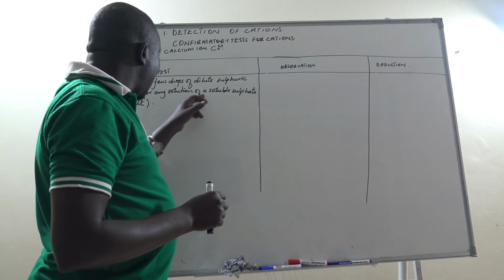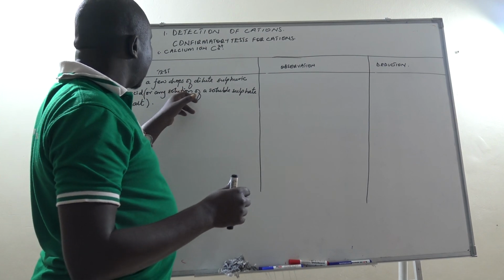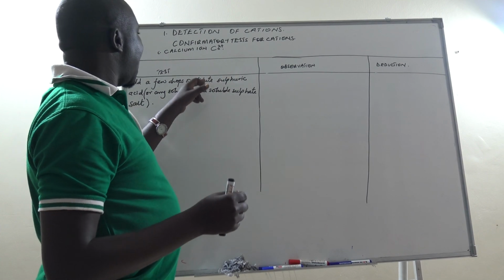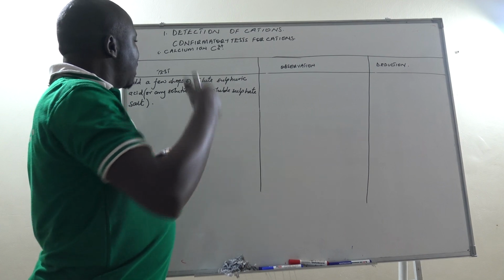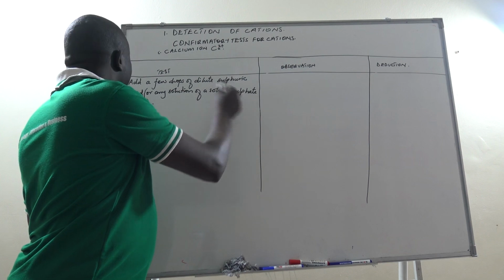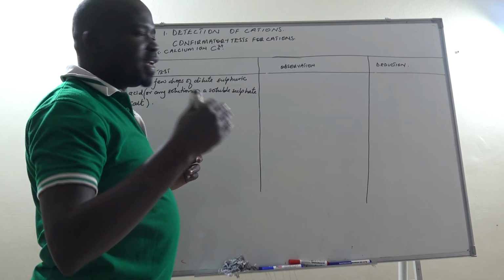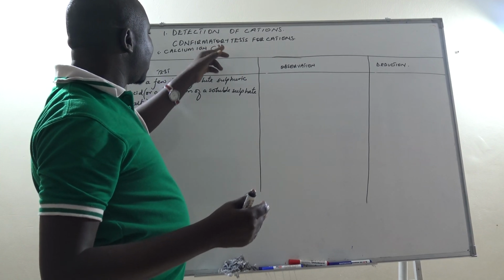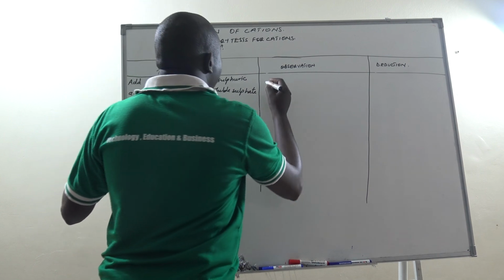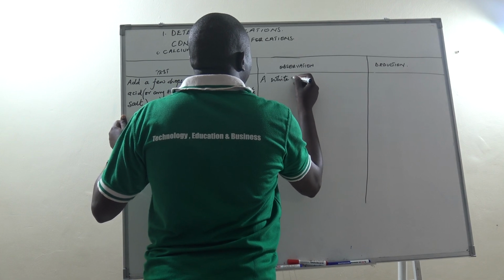If it is readily available and it is having a low price, or it is cheap, then we can use it in this case for testing for calcium ion, instead of using dilute sulfuric acid, because either dilute sulfuric acid that we have used or the soluble sulfate salt, its solution, they will play the same role of providing the sulfate ion that will have to combine with the calcium ion to form what we call calcium sulfate, which is formed as a white precipitate.